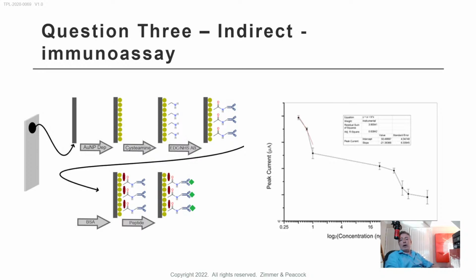I've talked about it in other webinars, but actually now I prefer to go from carbon and use pyrene NHS to just directly couple macromolecules to the carbon surface. But that said, if you're interested in CBD and THC and the detection of these things, you can either do it directly on electrodes, and ZP has done that. You can also do the indirect detection on electrodes using macromolecules, and that probably gives you better specificity, but then it's a more complicated manufacturing and more costly product.